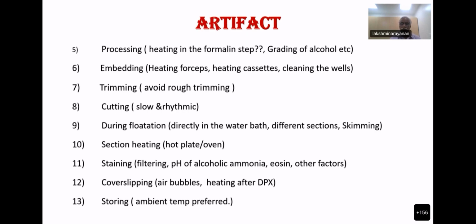And then absolute alcohol, if you are using, that is real ethanol. Then only the grading of 70%, 80%, 95%, and then absolute. Just blindly giving 70%, 80%, 90%, 95%, and one change of absolute. The real dehydration takes place in the last step, that is for nearly 1 hour, where the dehydration is incomplete.